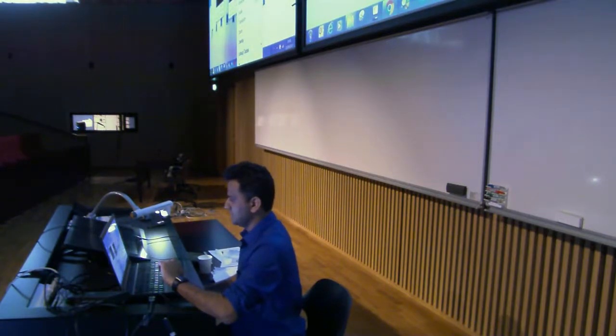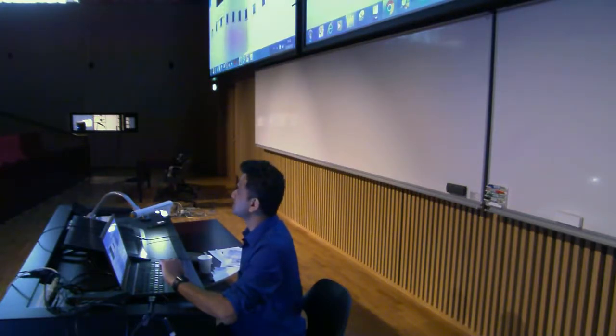Then what else? You can crop it, right? Let's say I just select this particular section here and then go to image, go to crop. It will crop to that particular location. Okay. Then it is also possible that you select your region of interest, okay, and you go to edit and you say clear.